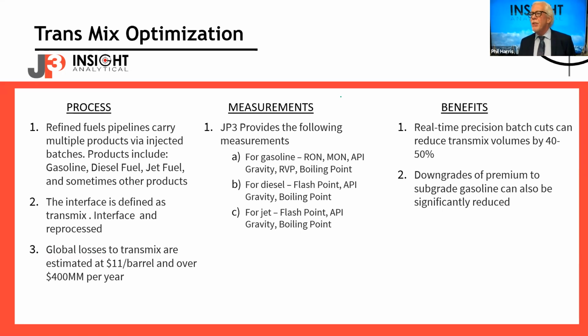Do all analysis measurements comply with repeatability specified by the standards? So the standards typically define what measurement method was being used. So we can't really say, hey, we are equivalent to the repeatability method of such a standard. But when we build the model, we test it against those standards.